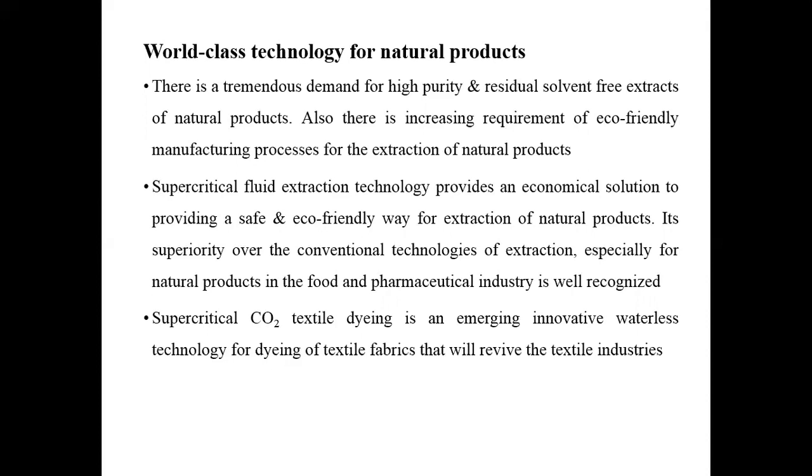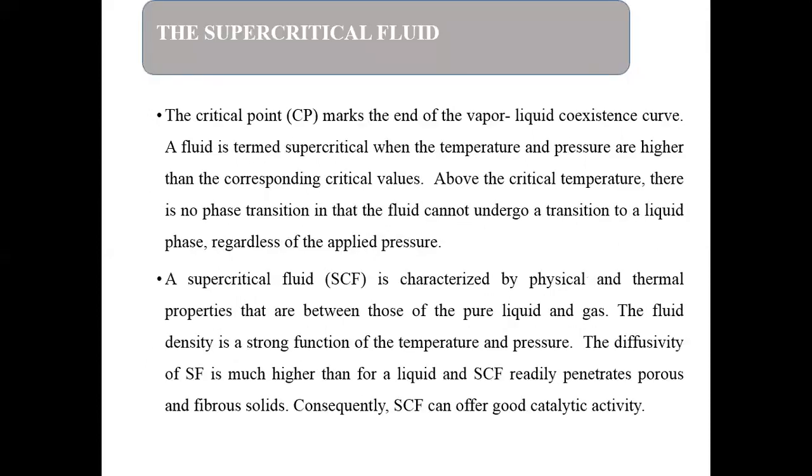Its superiority over conventional extraction technologies, especially for natural products in the food and pharmaceutical industry, is well recognized. Supercritical fluid is also used in textiles for dyeing purposes, an emerging innovative waterless technology for dyeing of textile fabrics that will revive the textile industries.